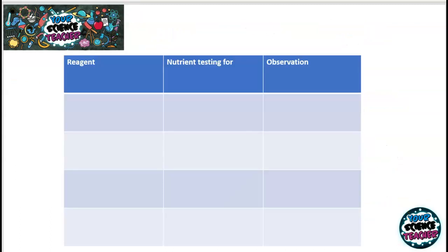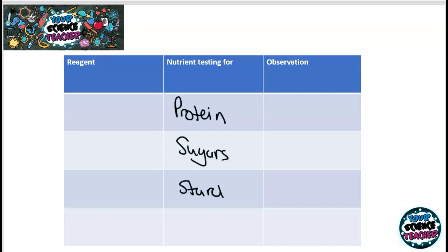In the topic of B3 organisation and the digestive system, the required practical is to do a food test — one of my favourite practicals. In this practical, we test for different nutrients: protein, sugars, starch, and lipids.